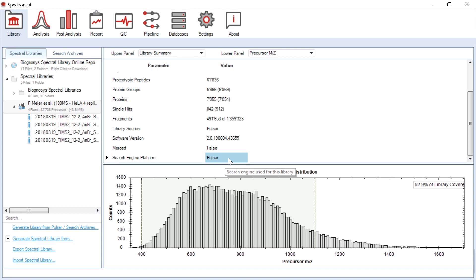Amongst the search engines that can process PASEF data, Pulsar also gives the best identifications in our experience.